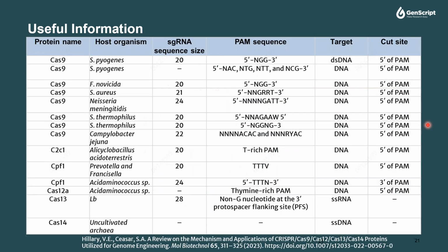And this is useful information that I prepared for you. I think different Cas systems will use different PAM sequences. So if you need to screen different Cas systems, you can use this toolbox to check what kind of PAM sequence you are going to use.